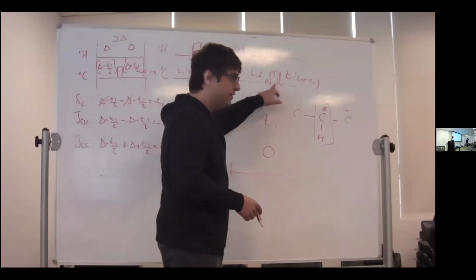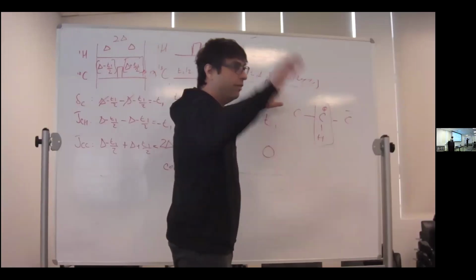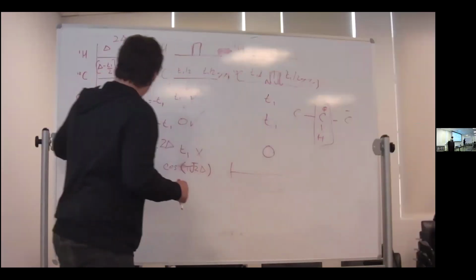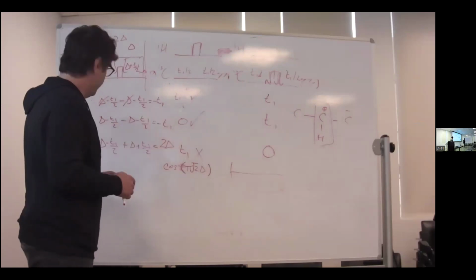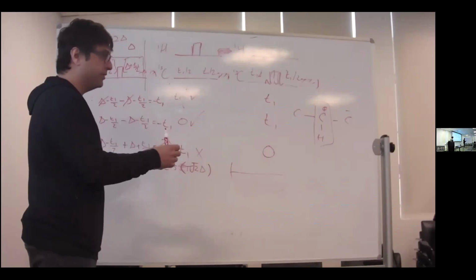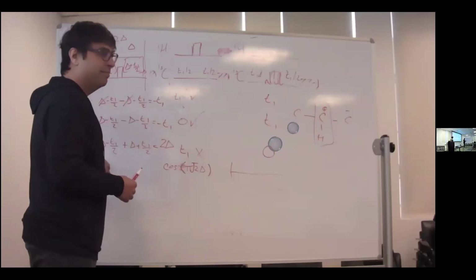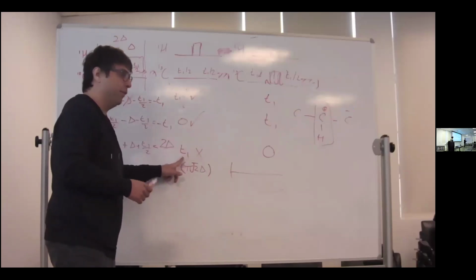Here we accomplish that by having a selective 180 on the other carbon. And you wind up with a spectrum in which you only had CH splittings, no carbon-carbon couplings. Here, you accomplish the same thing. You got rid of the CC couplings and you retain the CH couplings. So this experiment would be beautiful if you wanted to focus on the CH couplings. Now you could play tricks and say, well, what if you wanted to get rid of the CH and activate the CC? Oh, this is not the way to activate the CC. But in some of the other experiments we did, this gets rid of the CH and activates this, if you wanted to measure a CC coupling.